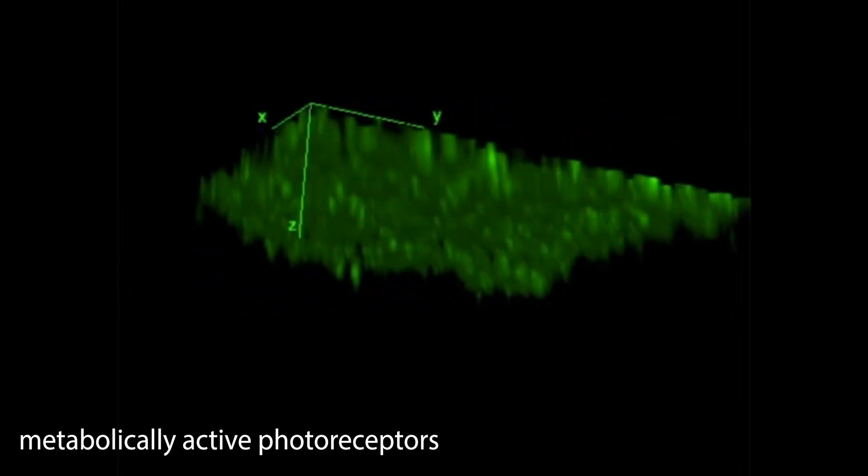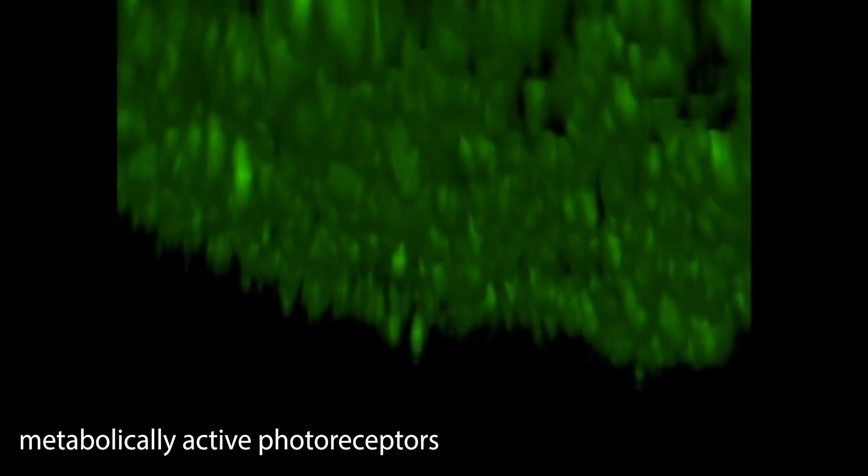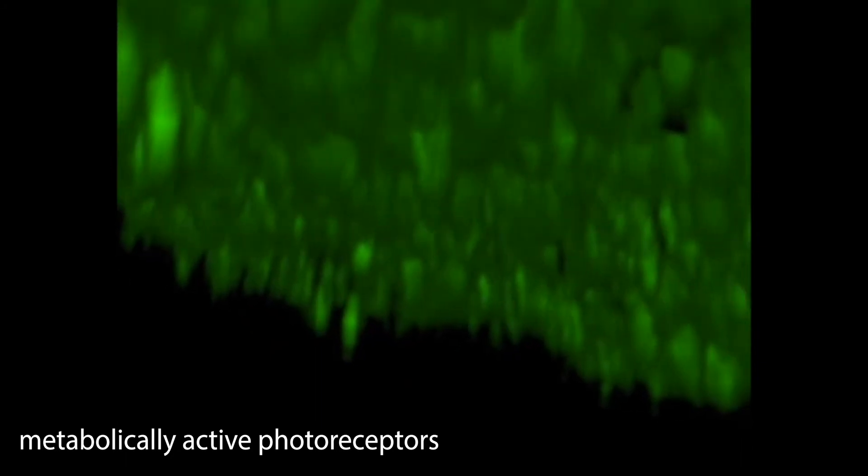We were able to visualize in real time the generation of biomolecules that are important for the normal function of photoreceptor cells.